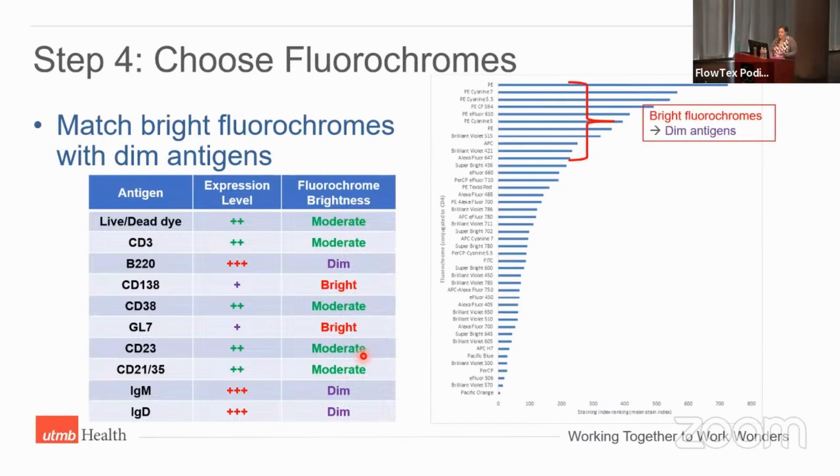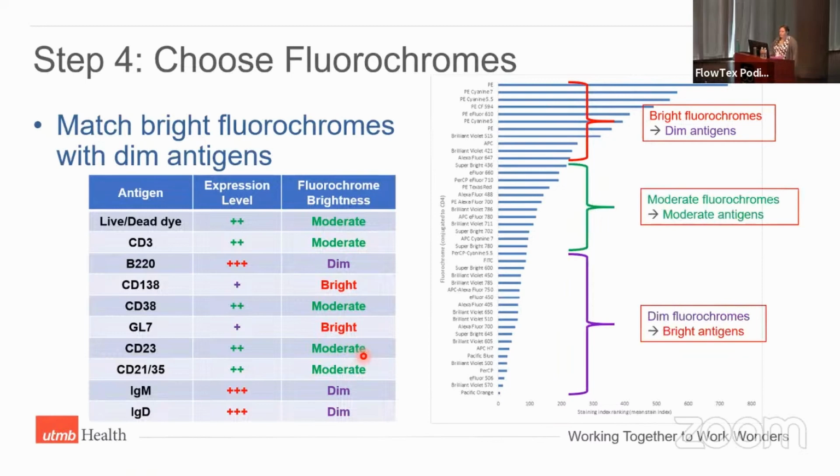So that's the big thing. I spent a lot of time going over this. A lot of my users also ask me, how do I break up one of these guides? Just split it somewhere. I'm asking you for bright, moderate, and dim. Give me like a third, a third, and a third. It's okay, it doesn't have to be perfect. You can make a best educated guess here, guys.